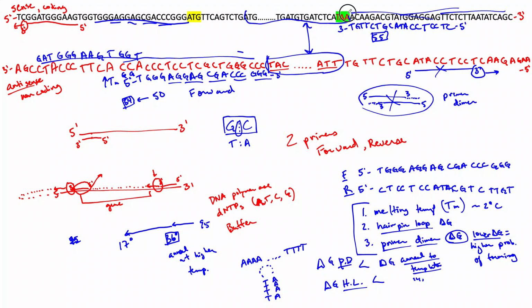But it's okay if we copy a little more than that, including some of this flank. Oh, here's the gene sequence, sorry. But it's okay if we copy a little more than that. It was funny I circled that because I saw this ATG and I thought that was a start codon. I want you to see that some genes will have other start codons in them. There's actually another ATG. So how do you know which ATG is the actual start codon?